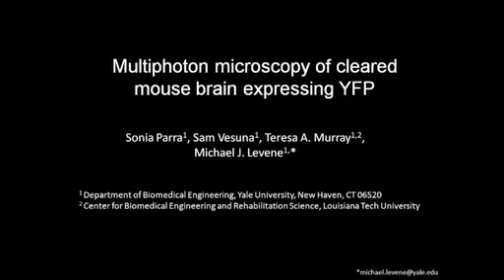Multiphoton microscopy of fixed tissue is normally limited to shallow penetration depths of just a few hundred microns. We recently demonstrated the first use of multiphoton microscopy as deep as several millimeters into fixed mouse organs using optical clearing with a solution of benzyl alcohol and benzyl benzoate. Our initial demonstration of the technique imaged intrinsic tissue fluorescence.